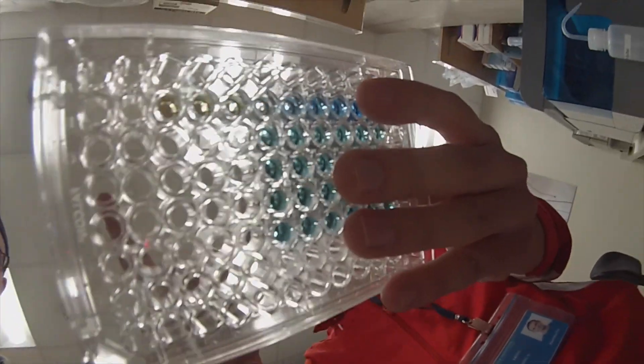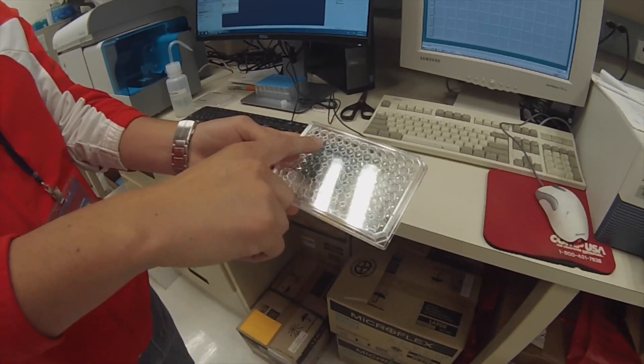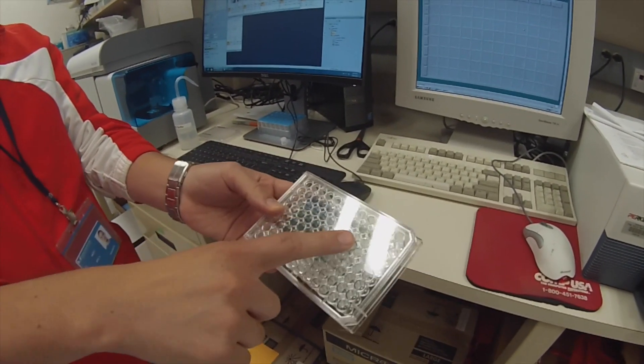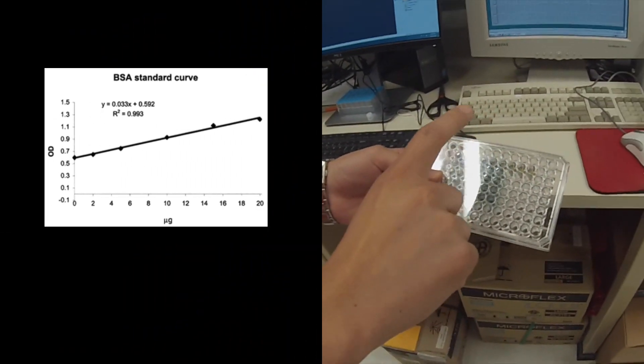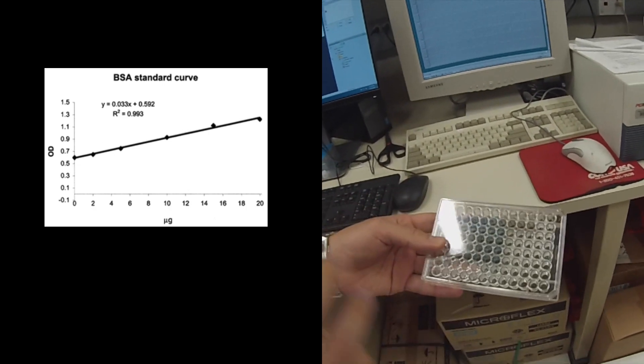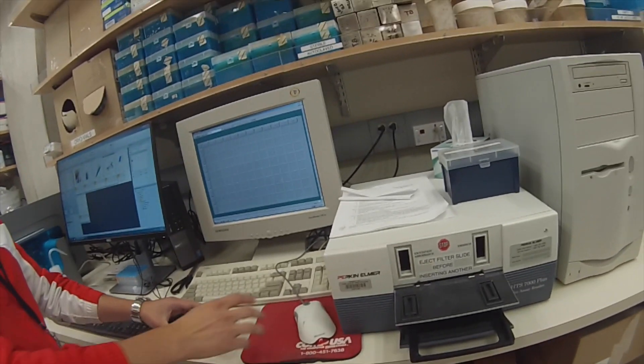The plate reader will give us the optical density of each of the wells. At the end we're going to have a curve so that we can compare the amount of protein, and then we will know exactly how much protein we have.